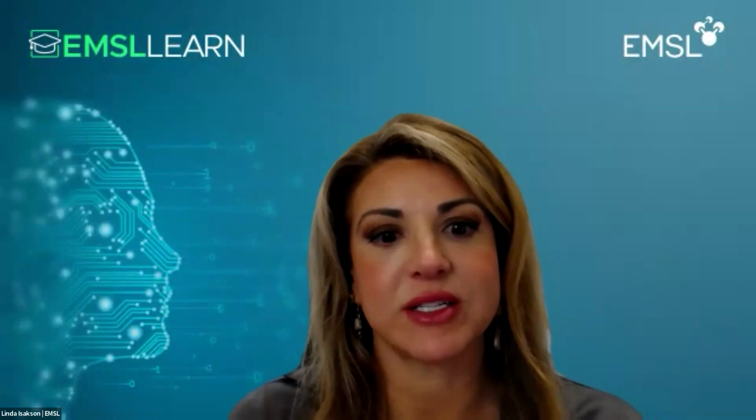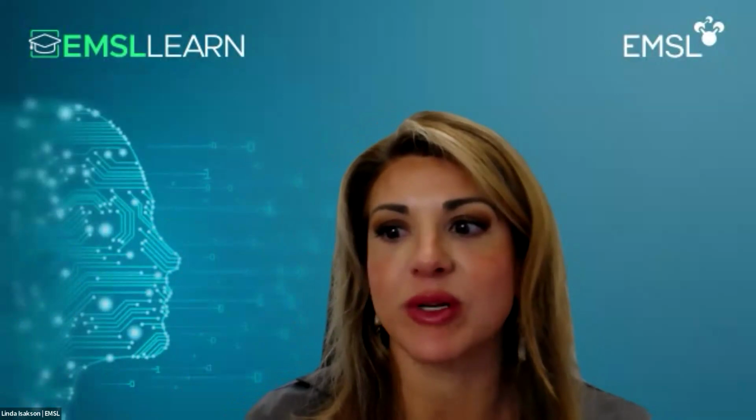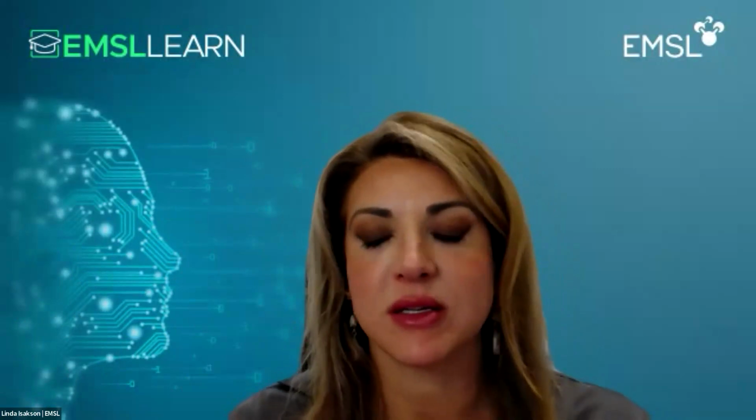Great. The next question is for you, Catherine. What factors of soil orders do you anticipate being important to how well oxidized carbon content relates to total carbon concentration or soil respiration rates?